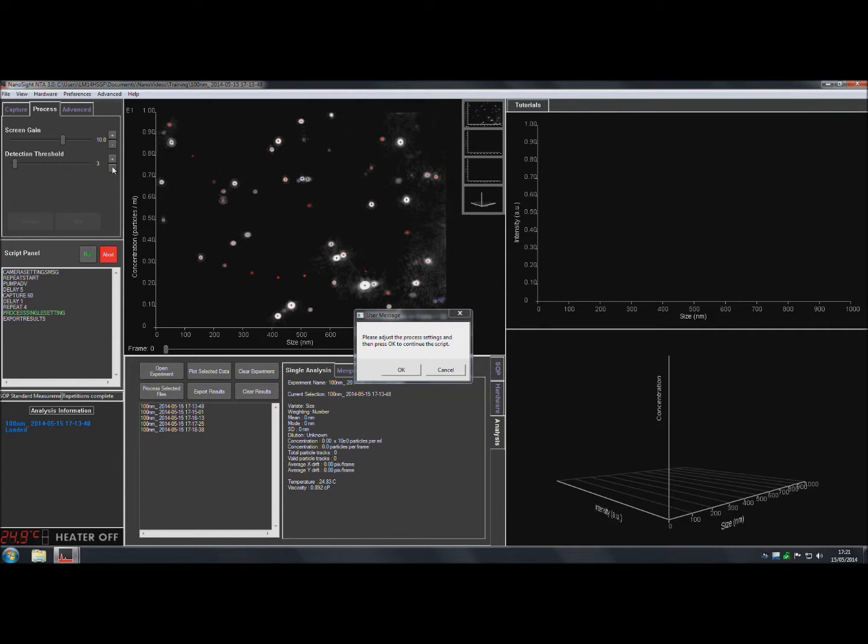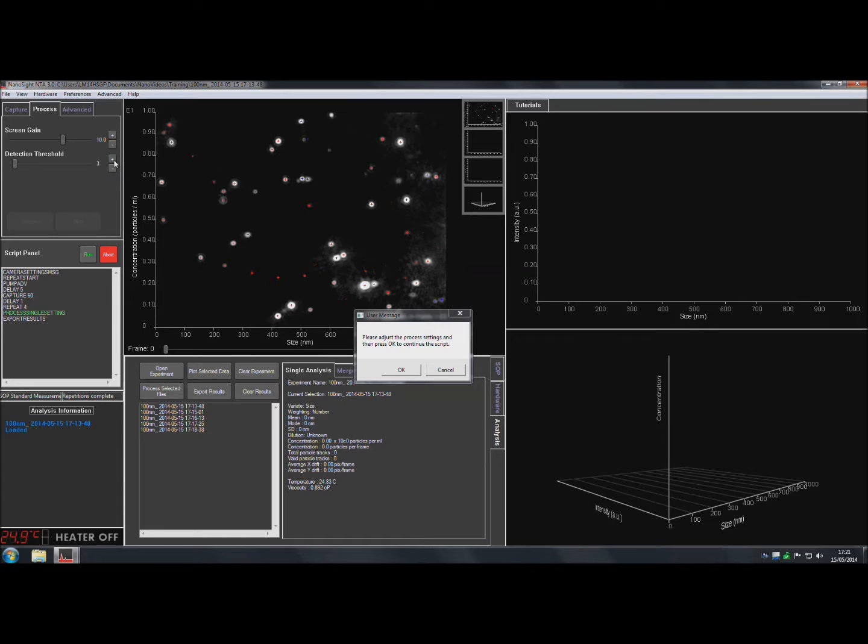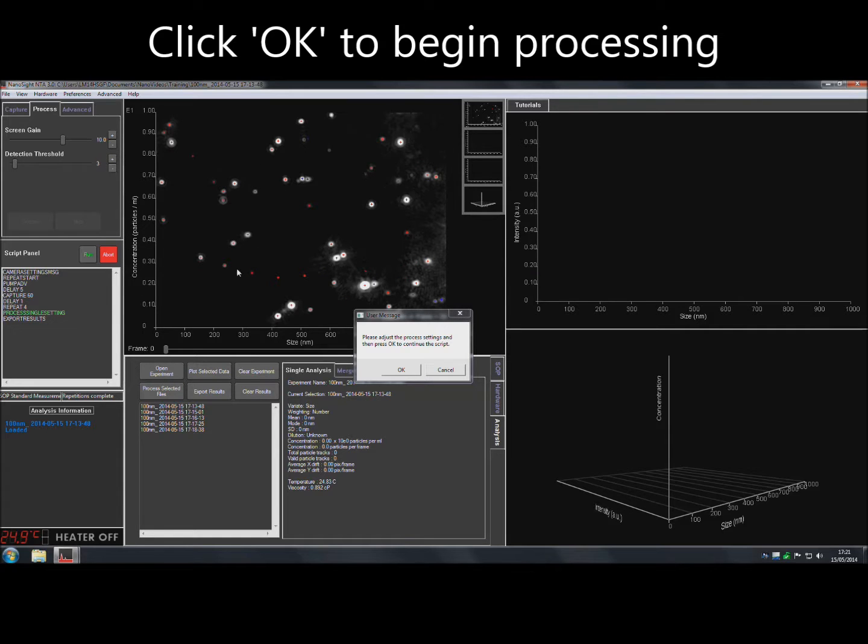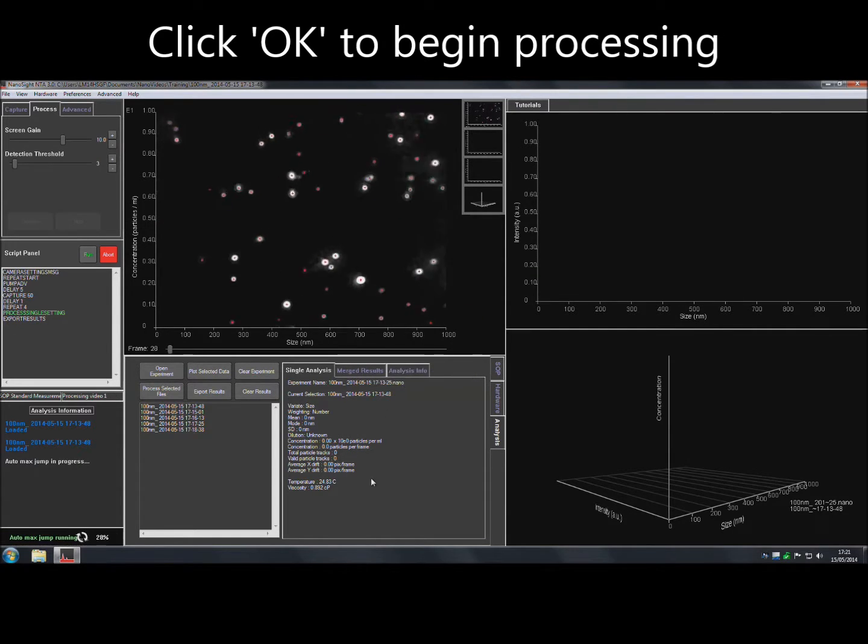To set the threshold, click on the plus or minus buttons until each particle has a red cross in the center. Try to keep blue crosses to a minimum as these signify noise. Click OK to begin processing.